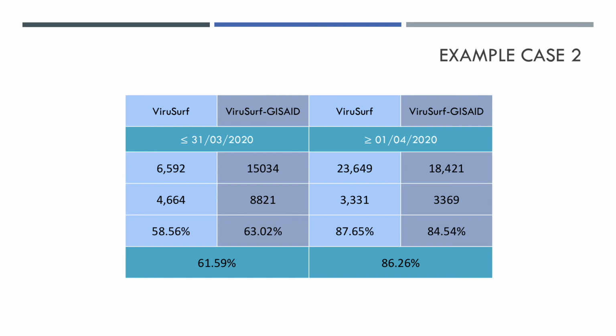If our matches are summed up over the two non-overlapping databases, we obtain that the sequences with the mutation from samples collected up to March represented the 61.6%, while these increased to more than 86% in the following months.